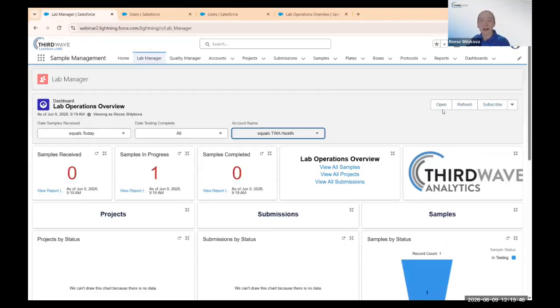But before I go there, I do want to highlight a few buttons. Absolutely, we could do that. Just ask Sia. She'll be able to pick someone. Oh, there we go.